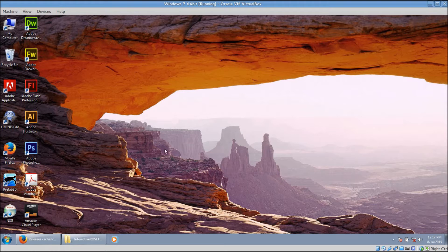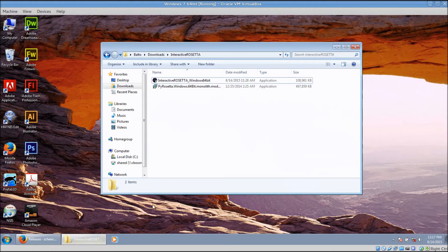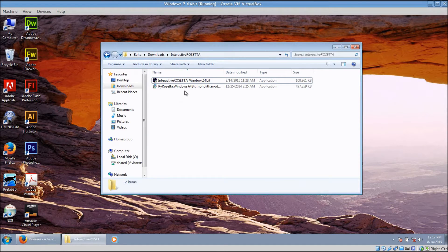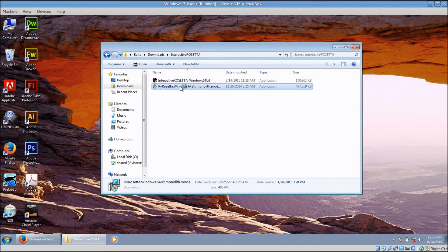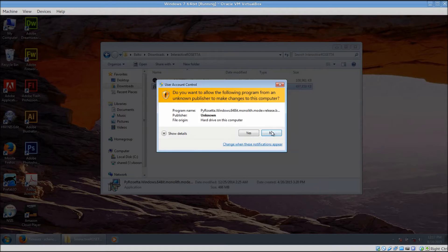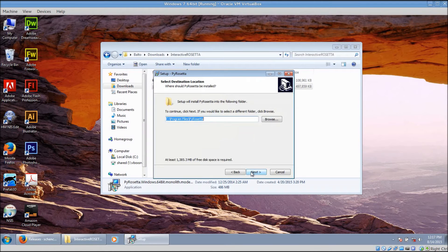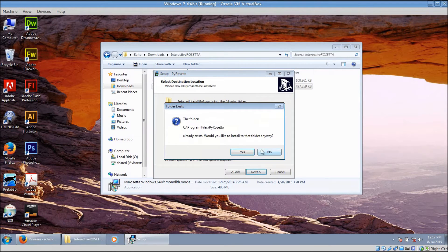I have a copy of both installers located in this folder right here. You need to install PyRosetta first, so double-click on its installer. Just accept the default for everything.